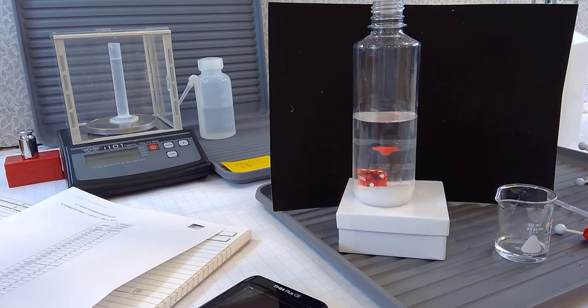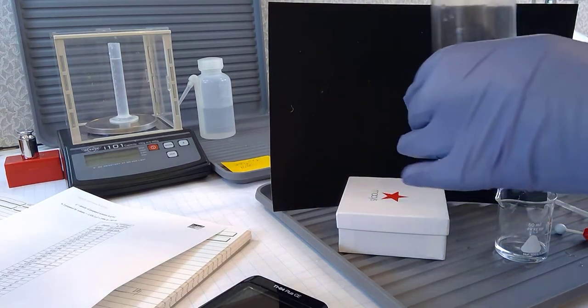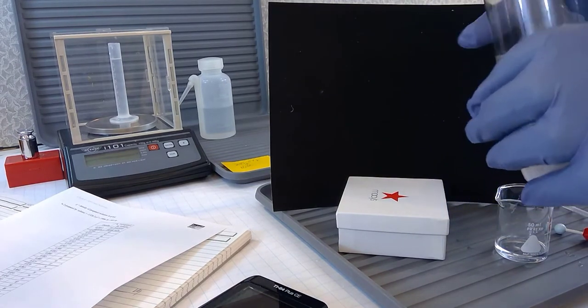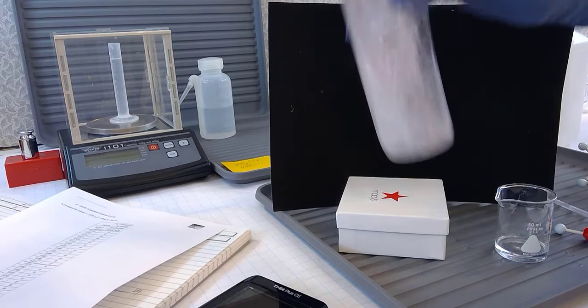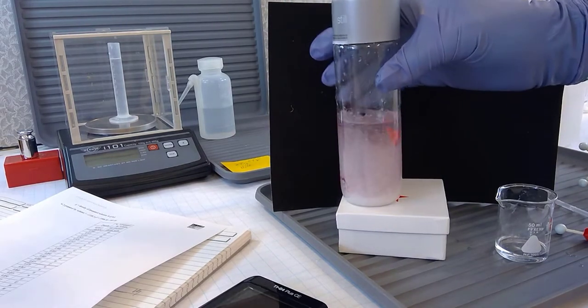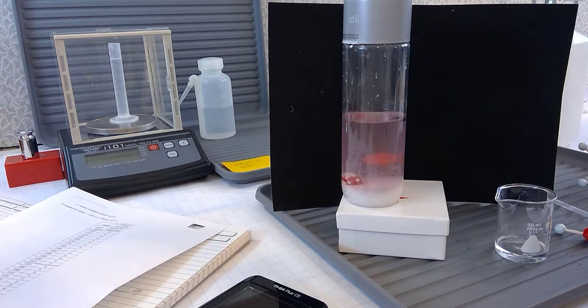And now I'm going to do some shaking. Another use of propanol is it gets rid of grease and oils industrially. It dissolves them when water doesn't. And here you've got the permanent marker, which is non-polar.